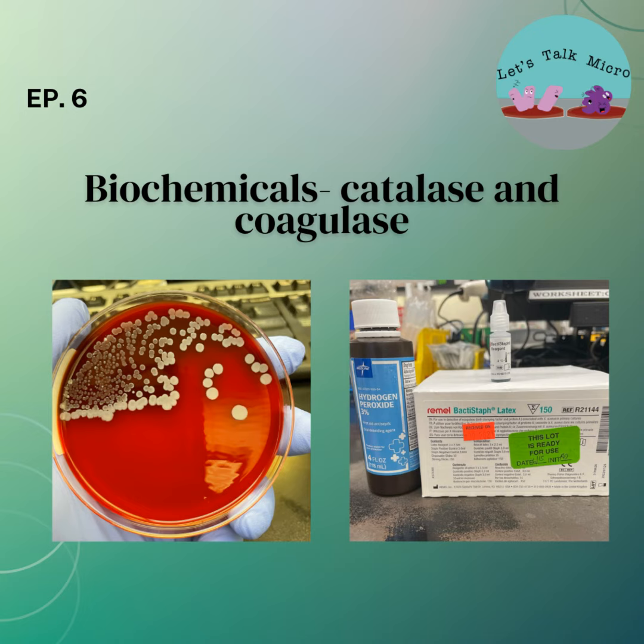And keep in mind that we don't use all the reactions for all the organisms. That would be wasteful, not only as far as wasting actual supplies, but there are some biochemicals that you don't need to do for certain organisms. If you perform them, you have to document them, and your patient might be billed for something that wasn't necessary. So the patient might get charged more, and you're wasting lab supplies. So it's good to correlate those biochemicals to the specific organisms.